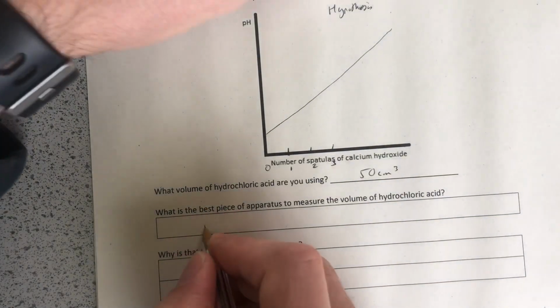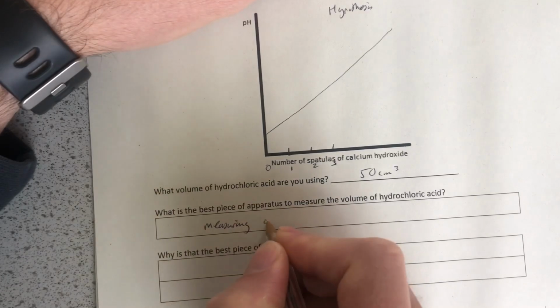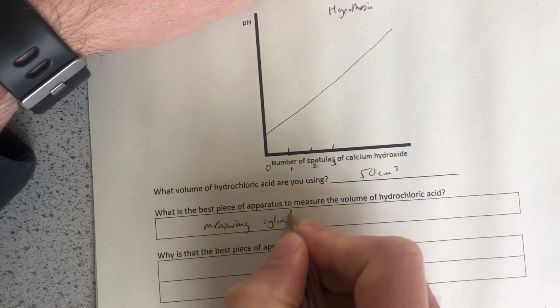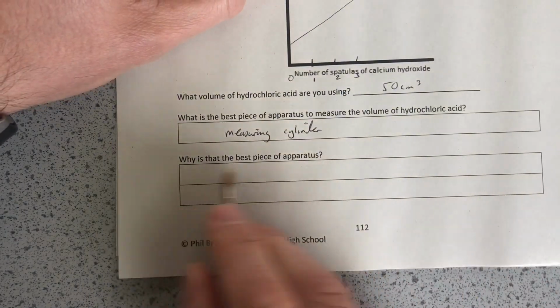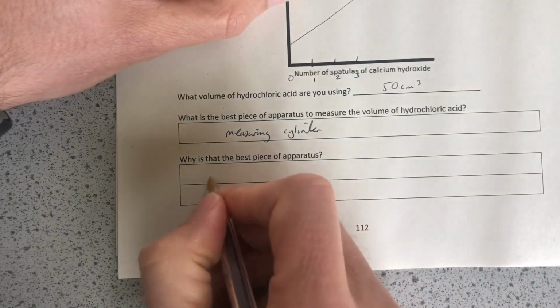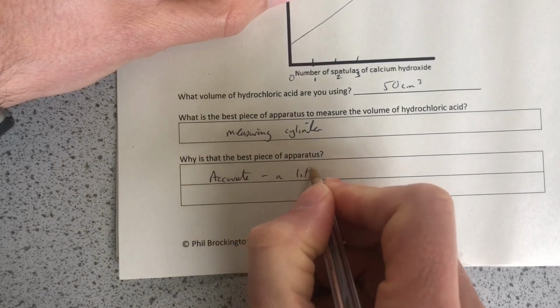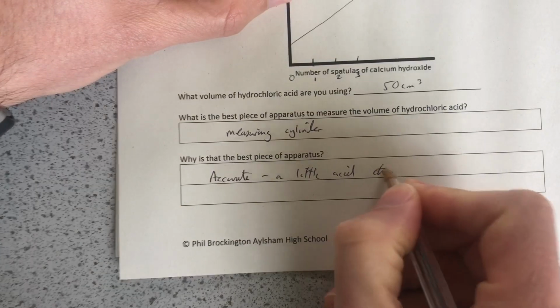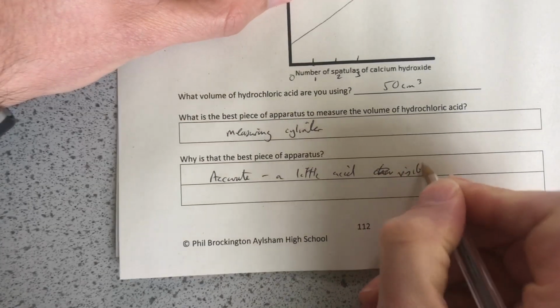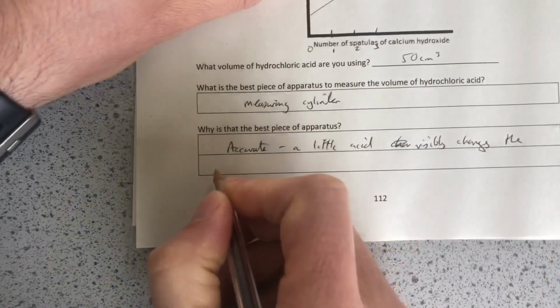So the answer is measuring cylinder, and that was a question I think on the 2019 higher tier separate science paper. Why is this the best piece of apparatus? It's accurate. A little acid visibly changes the height.